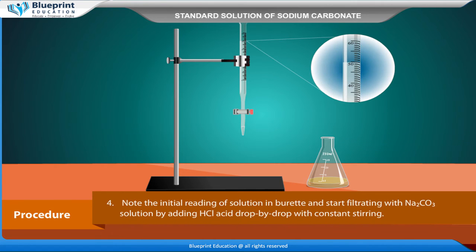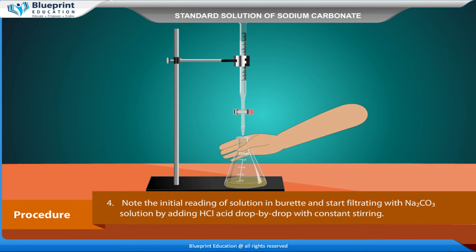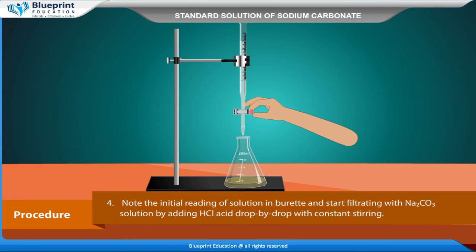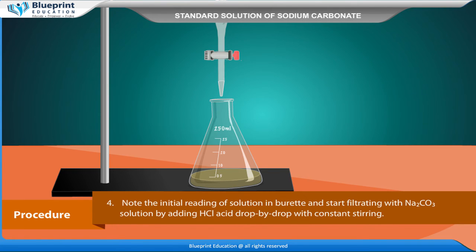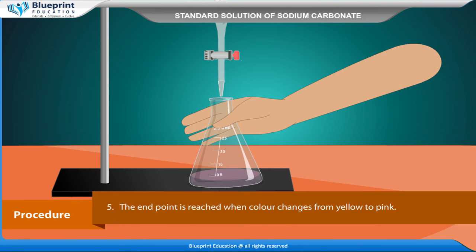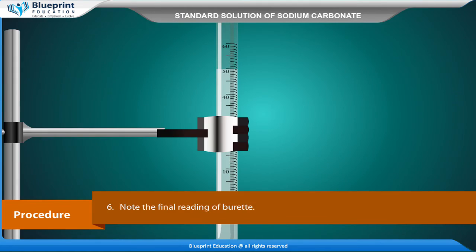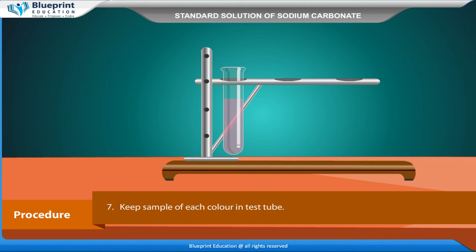Note the initial reading of the solution in the burette and start titrating by adding HCl acid drop by drop with constant stirring. The end point is reached when the colour changes from yellow to pink. Note the final reading of the burette. Keep a sample of each colour in a test tube.